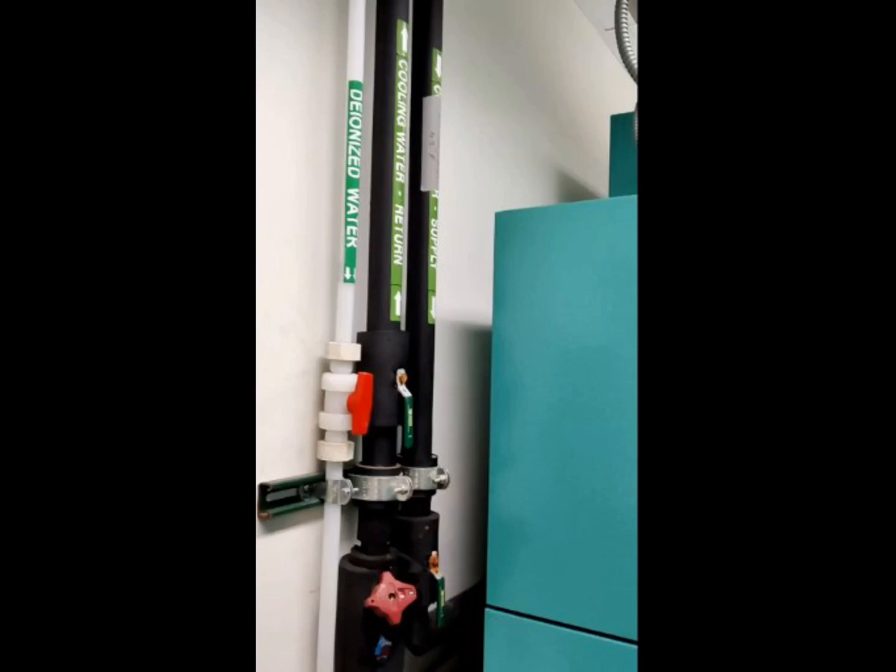For a machine this sophisticated, which can nurture life very precisely, there are many pipes and wires running in and out of it. These three pipes feed water in and out of the system of the machine. The leftmost pipe is feeding a special type of water called DI water into the system. DI water has all of its minerals removed. As a result, there's no risk of these plants getting any unexpected minerals as there would be if normal water was given to them.